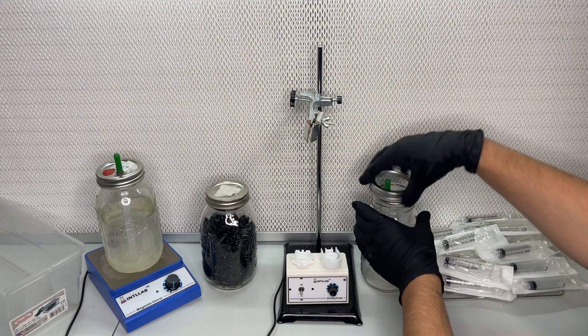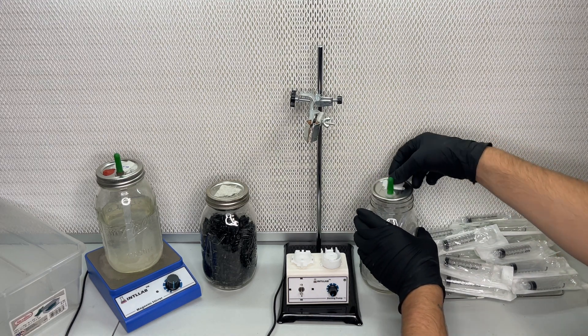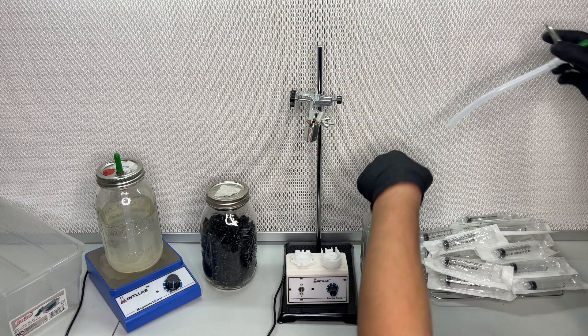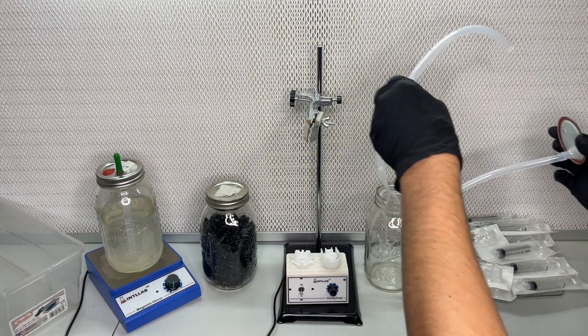A peristaltic pump uses a small motor to spin these wheels which pinch the tubing, moving the liquid along the tube without actually touching it.